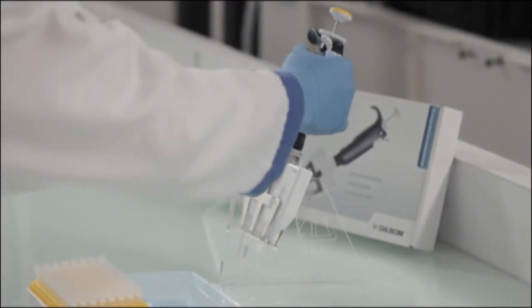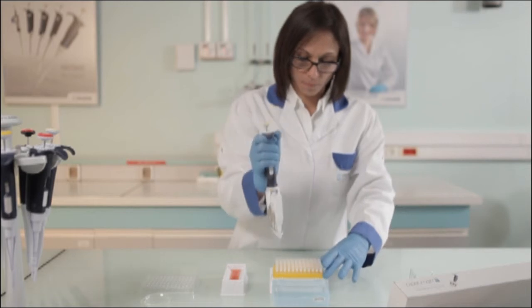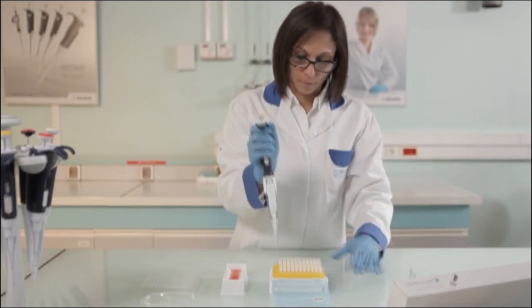For application with microplates, you can enjoy Pipet-Man L benefits with multi-channel models.